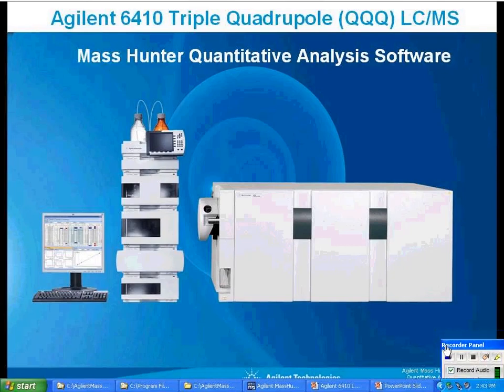Let's talk about customizing the quantitation engine, specifically in terms of bracketing. And I will define bracketing as a different association between the samples and the calibration samples. Typically, we associate all the calibration samples together and apply them to all the samples that are in a batch. Bracketing is slightly different than that.